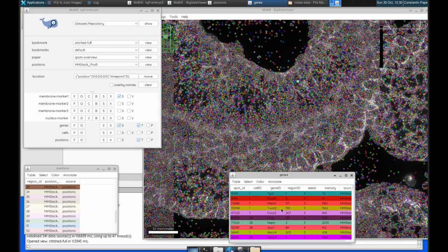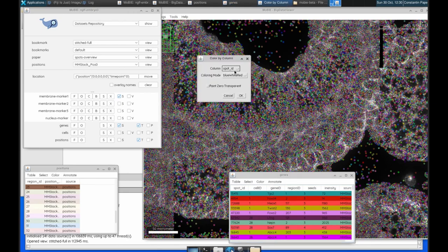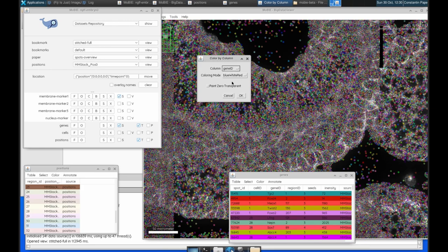So let's change that, let's instead colour by the gene ID. We can go colour, colour by column, we can find the gene ID column, and we can tell it's used this Glasby colouring mode, and then click OK.